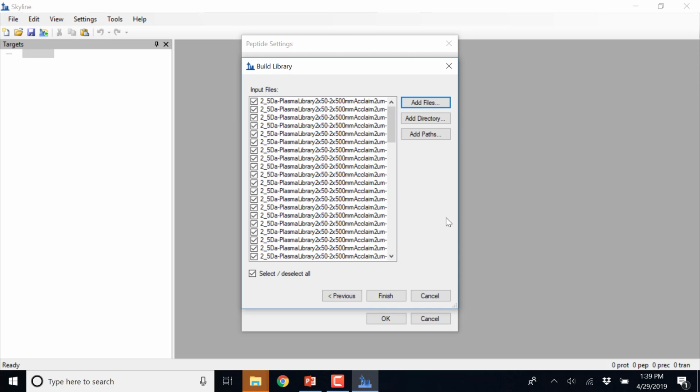Hold on, I can't hear very well. Oh, that's the library. You need to go on to the next in order to find all those files. What you were doing is selecting a library that already exists and calling it that. So if you change the name, yeah. Okay, no, that should be fine. Just go to next.